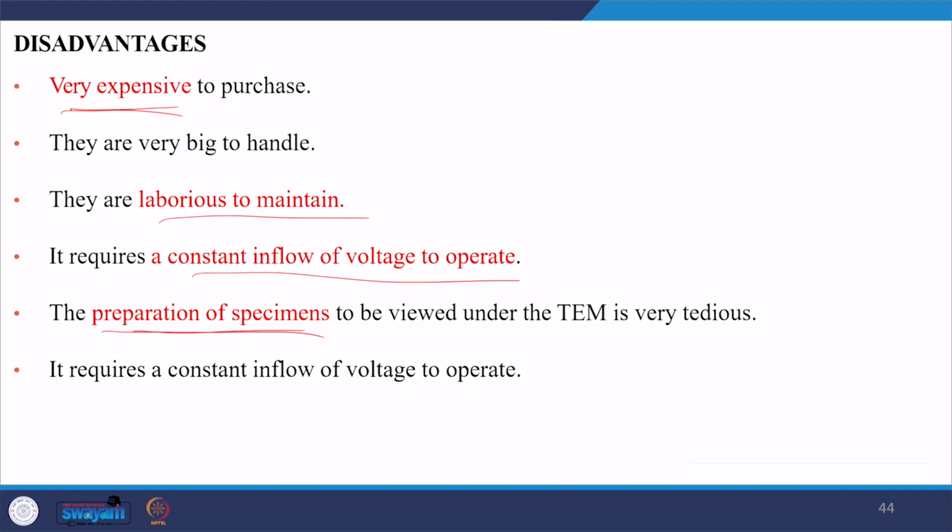So these are the various aspects of TEM image analysis as a characterization technique. Once we prepare nanomaterials, we can use TEM analysis to characterize the material's properties, morphology, structure, shapes, anything. Okay, thank you. So today is up to this.